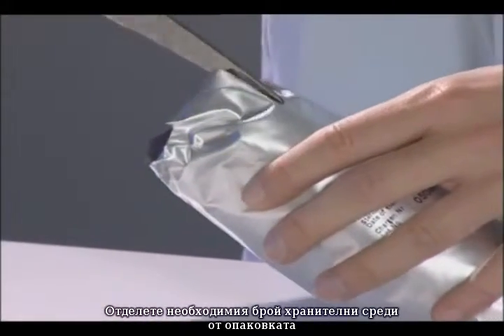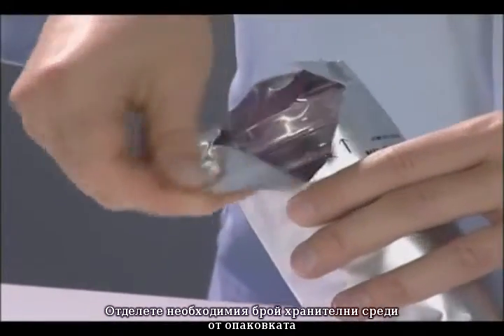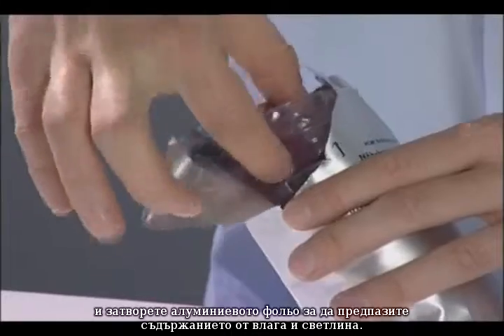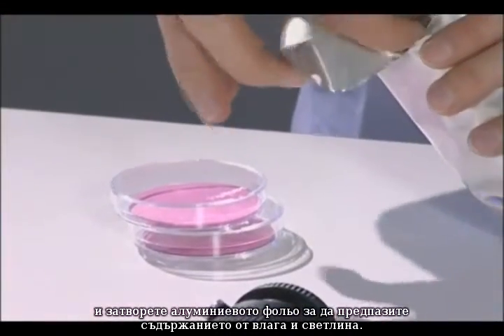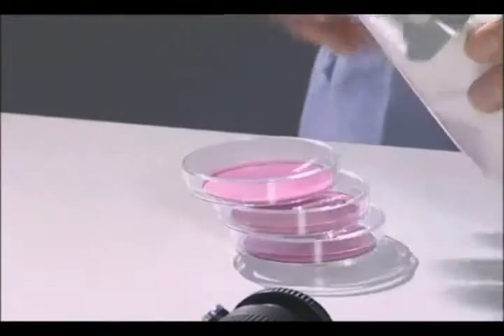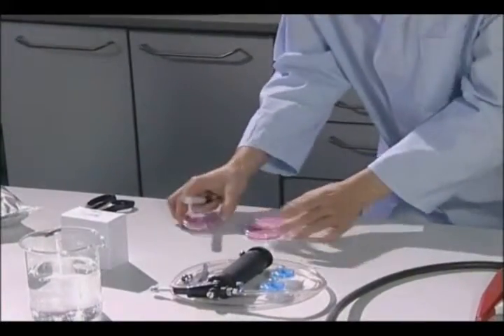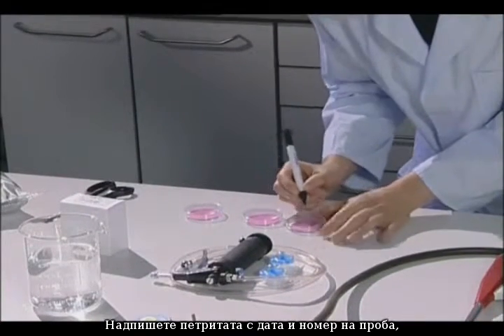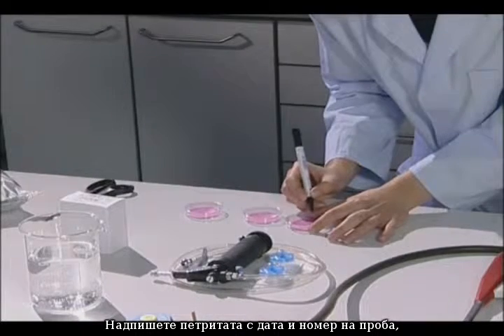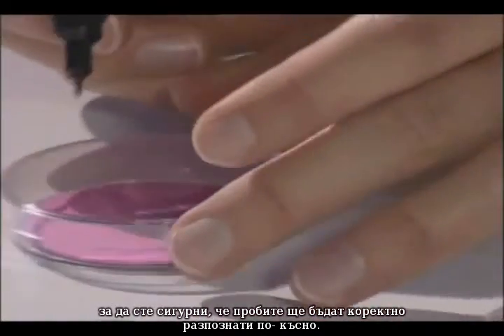Remove the required number of petri dishes with nutrient pad sets from the packaging and close the aluminum foil again to protect the contents against humidity and light. Properly label the petri dishes with date and sample number to ensure that the samples can be correctly allocated later.